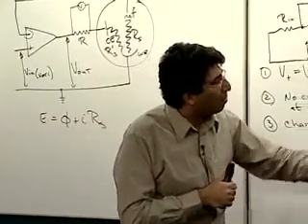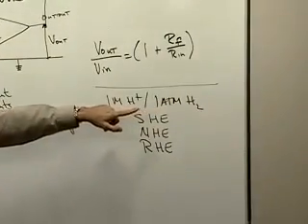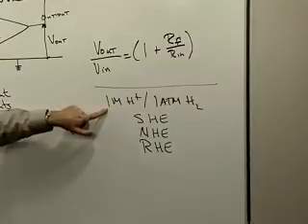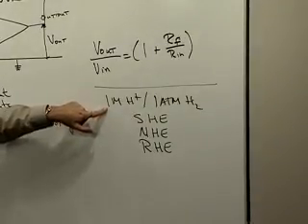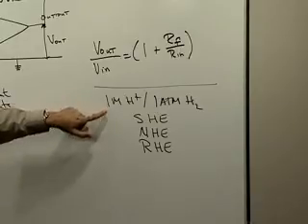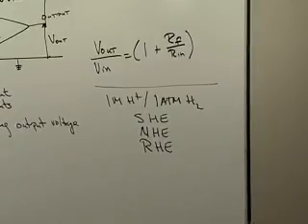Okay. Well, what is bad is that hydrogen gas is going to bubble through this aqueous electrolyte, and it's going to cause the water to evaporate rather quickly if you take gas through electrolyte. And so your 1 molar protons are not going to stay 1 molar, and that cell drifts just horribly as a result of that. So people don't use it because of that.